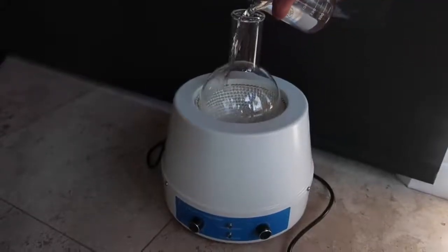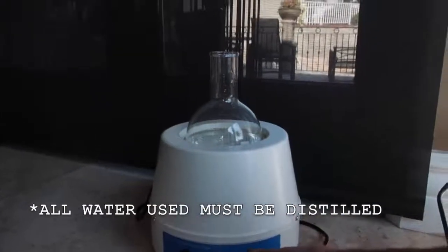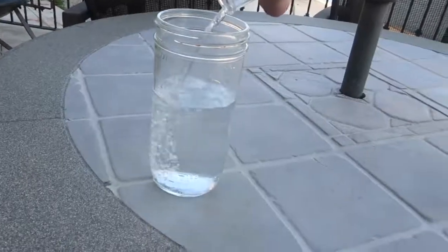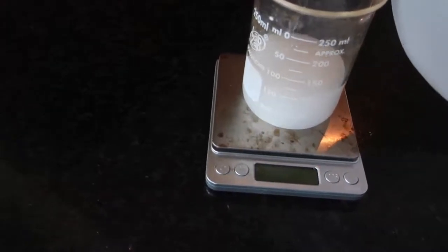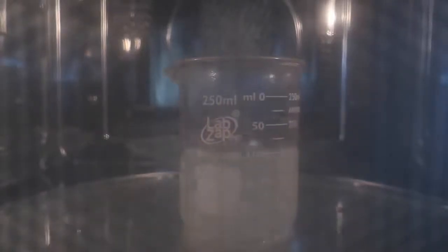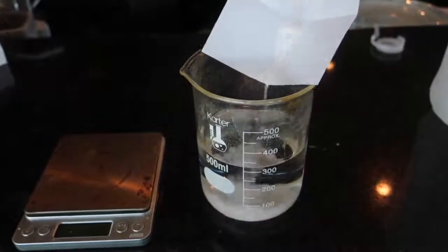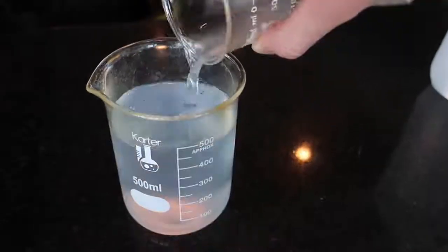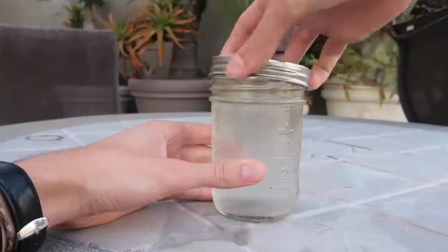For the Briggs-Rauscher reaction, I need to make three different solutions. For the first solution, I mixed together 500 milliliters of water with 22 grams of potassium iodate and 2.3 milliliters of 98% sulfuric acid, stirred it with a magnetic stirrer, poured it into a jar, and capped it off. For the second solution, in a separate beaker, I added 175 milliliters of water to 0.2 grams of cornstarch, mixed it thoroughly, and boiled it in the microwave to make sure all the starch was dissolved. In yet another beaker, I mixed together 325 milliliters of water with 1.7 grams of manganese sulfate and 7.8 grams of malonic acid. Once everything had dissolved, I added the cornstarch solution to it, filtered it through a coffee filter several times to remove any excess cornstarch, and capped it off.